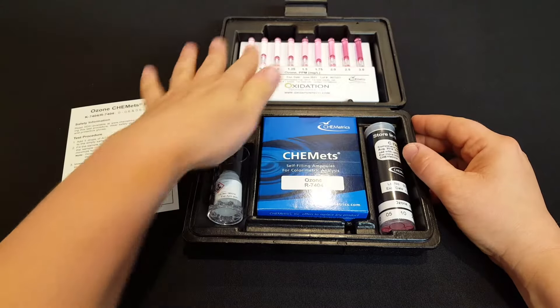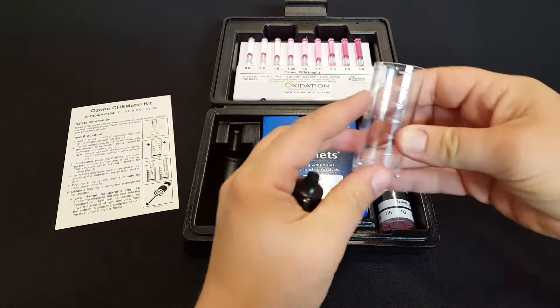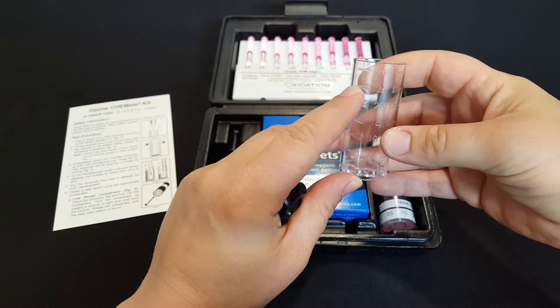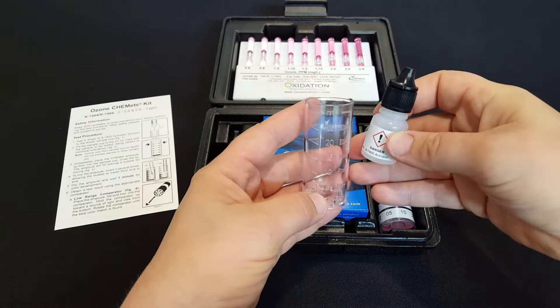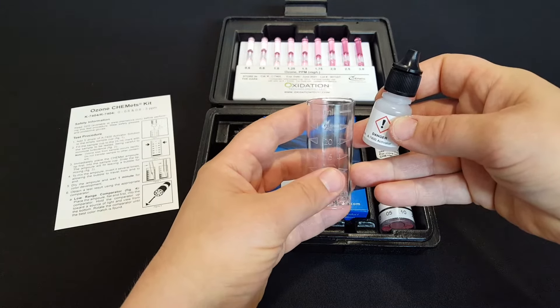Within the kit there are five main components. There's the sample cup which goes up to 25 milliliters — this holds the dissolved ozone. Then there's the activator solution which you add to the dissolved ozone and it causes a chemical reaction, which is an important part of the test.